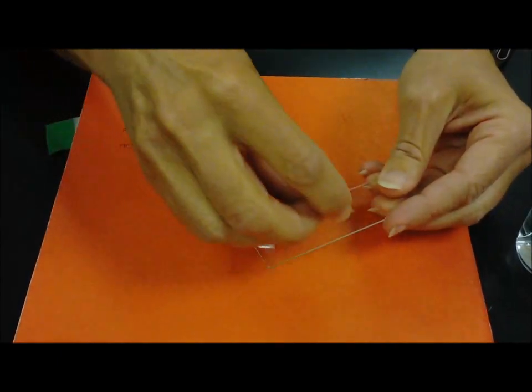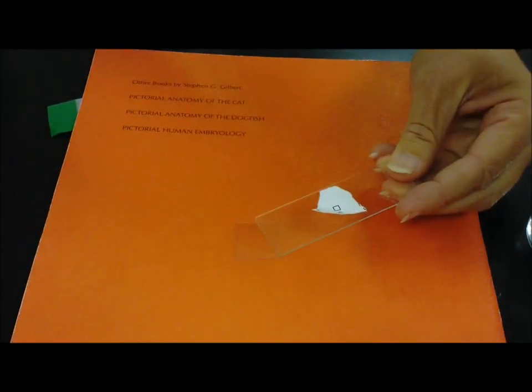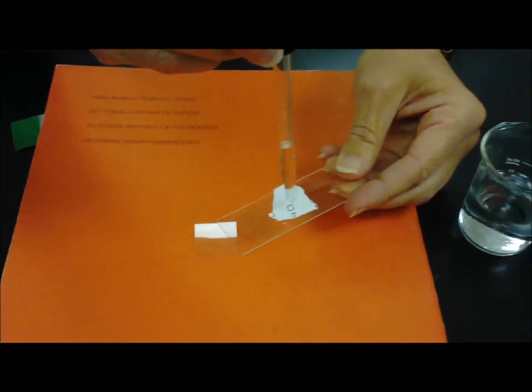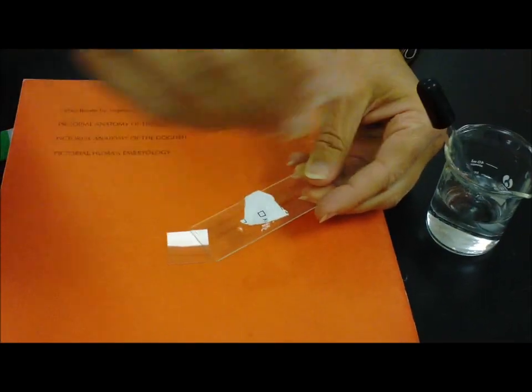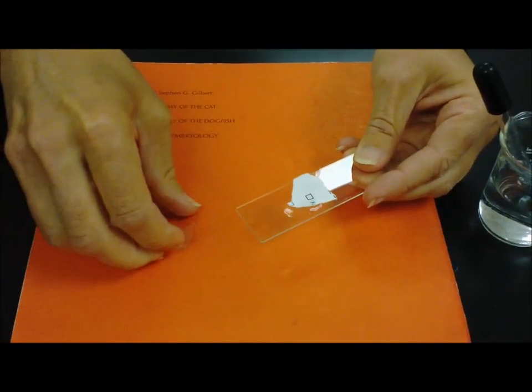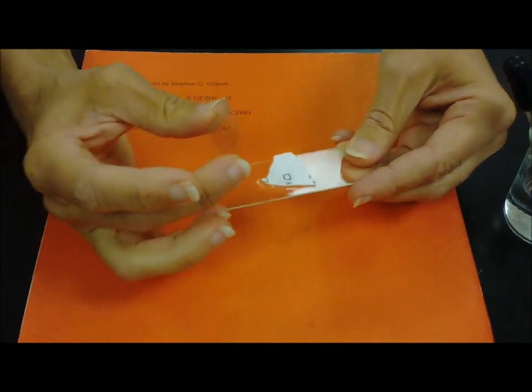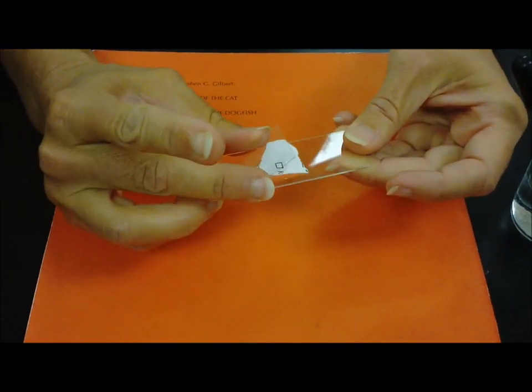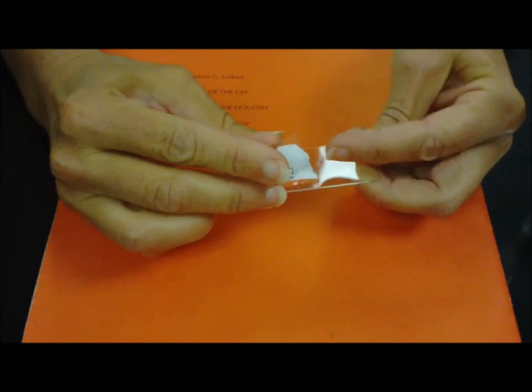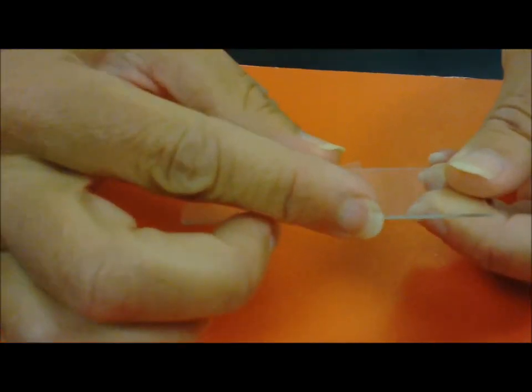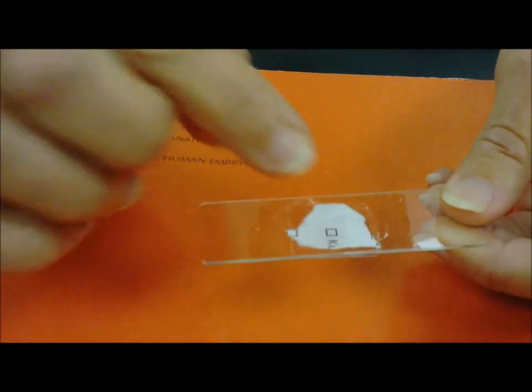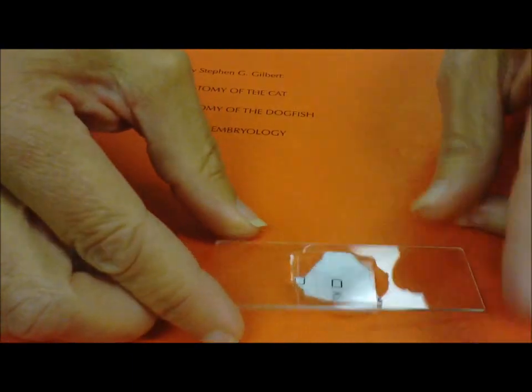So to make a slide, I simply put my item that I want to look at on the slide and add some water. A drop or two should be enough. And then when I'm putting the cover slide on, I want to put it on at an angle and sort of let it drop from one side to the other so that it will squish the water out and not create a bubble.